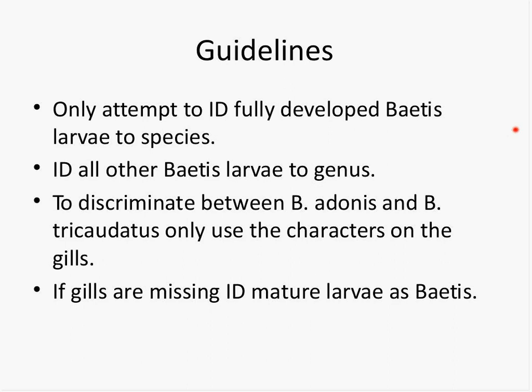So, Brady, I don't know if you want to come over and talk to this. After we've basically sat and looked at, literally, live mounted thousands of specimens down there, we can't really come up with a good way to separate out all of the immatures. And for the larger specimens, the only character that we can find to at least separate these critters out to a nominal species name that's actually in the literature is in the gill character.